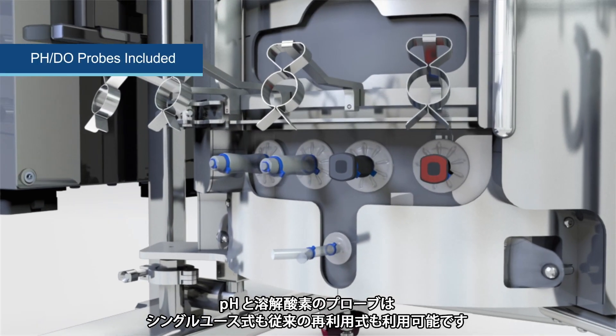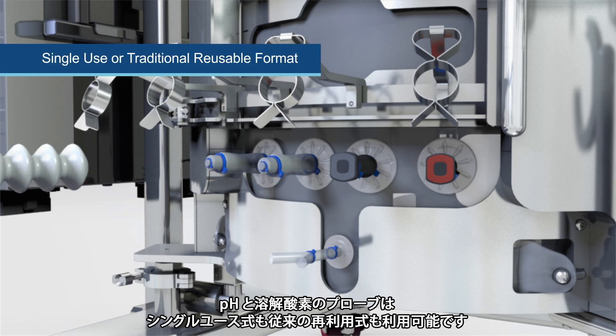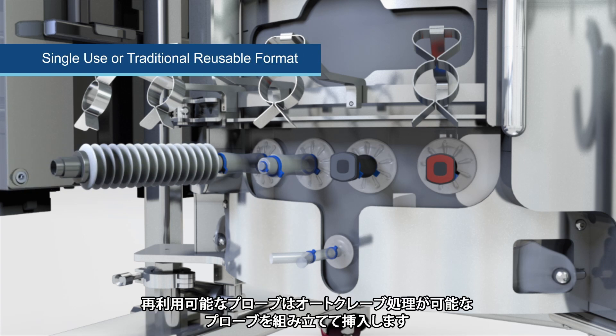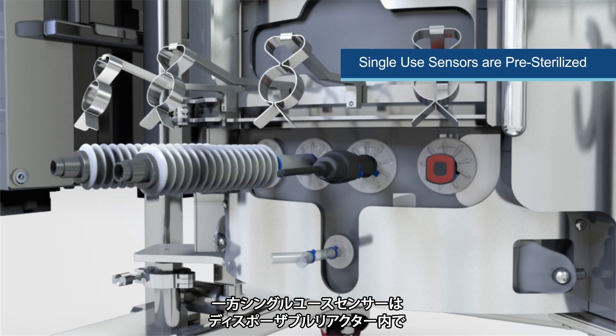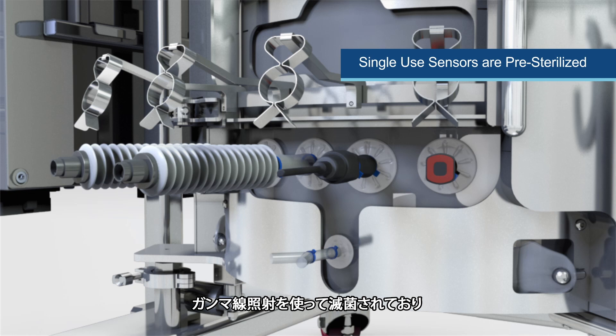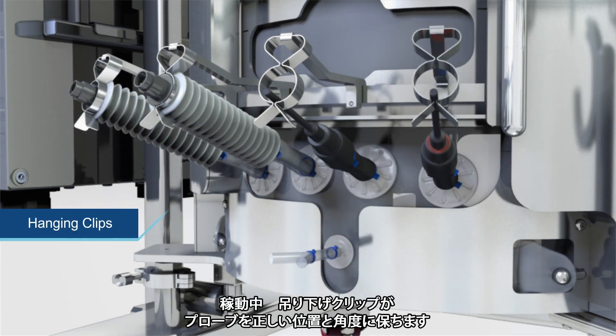pH and dissolved oxygen probes are included in either single-use or traditional reusable format. Reusable probes are inserted using an autoclavable probe assembly, and the single-use sensors are pre-sterilized using gamma irradiation in the disposable reactor, providing a closed system that is ready to use. Hanging clips hold the probes at the correct angle and position during operation.